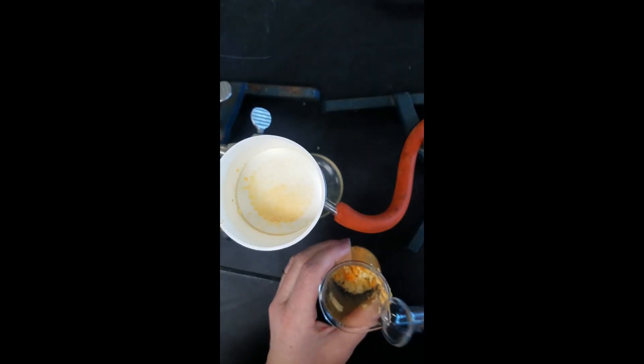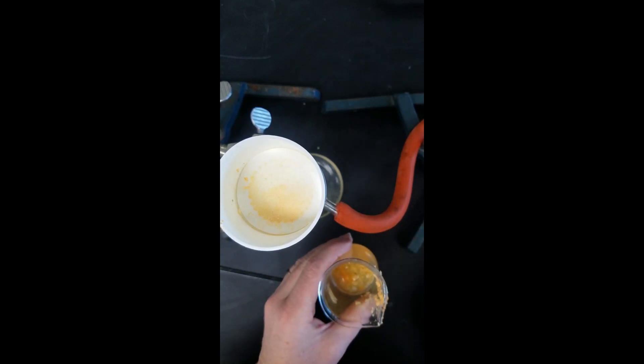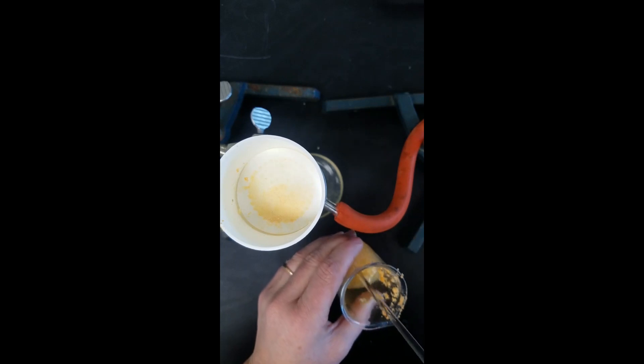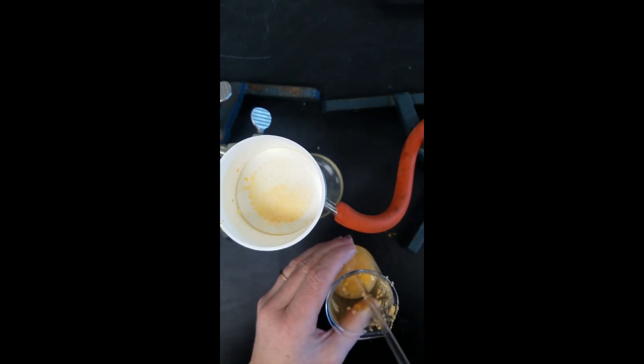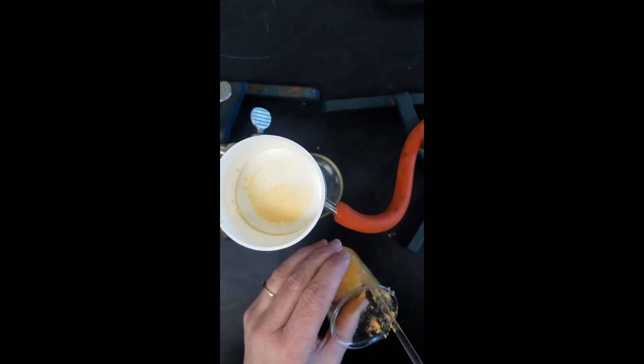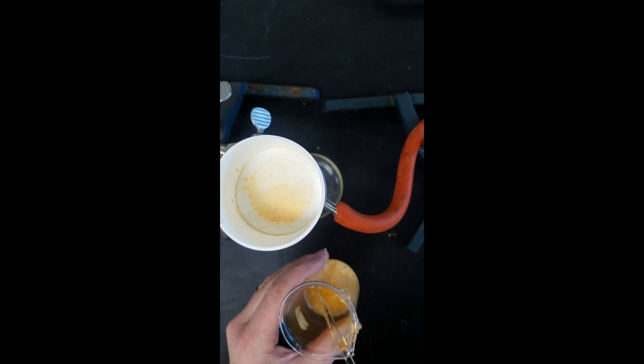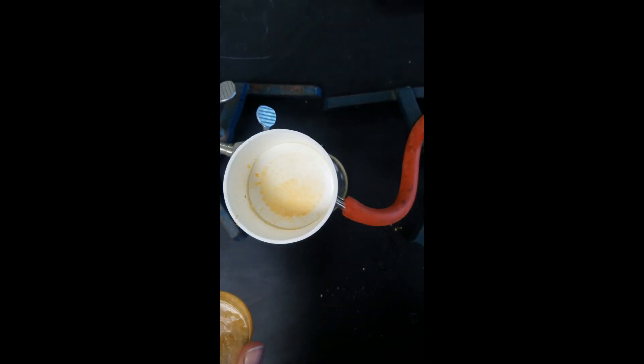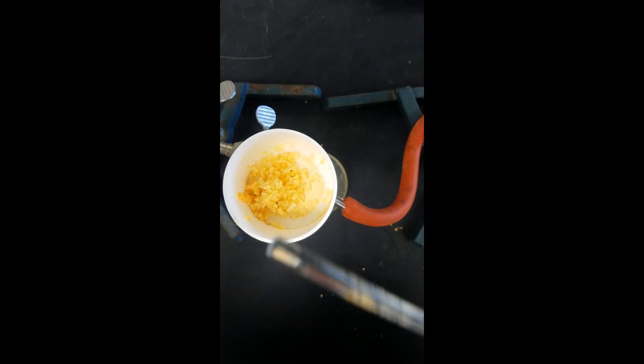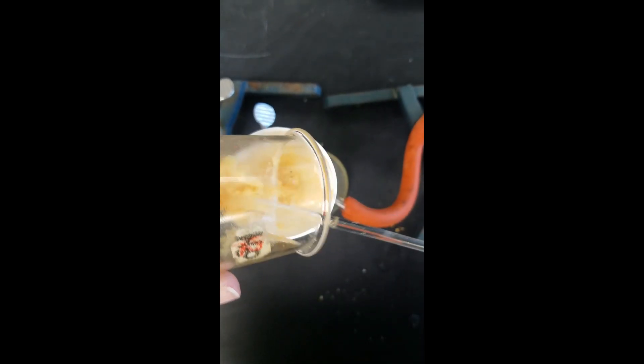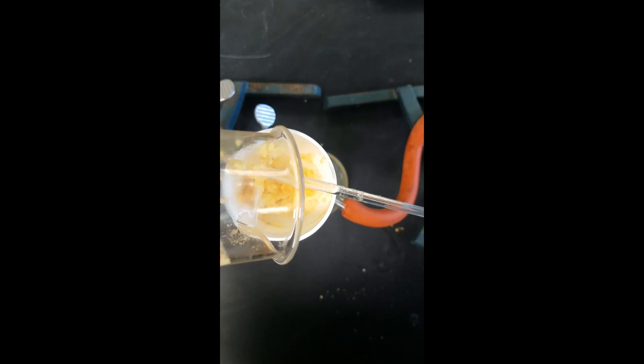This is the second addition of the petroleum ether, and we're going to stir this for a minute again. Pouring the second addition of petroleum ether into our filter. And we're going to allow the vacuum to run again to draw that petroleum ether out for another minute.